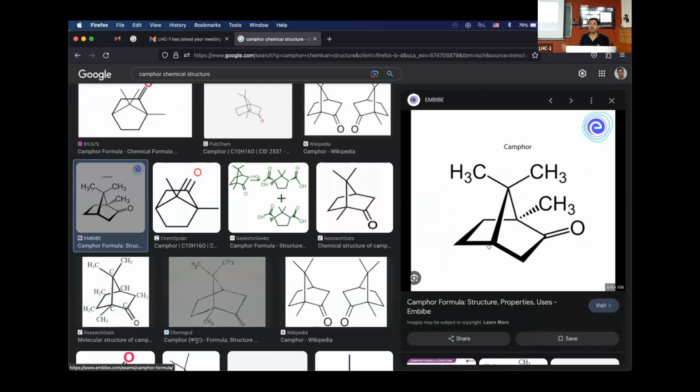And in addition, you are reducing the hyperfine coupling splitting between protons and scalarly coupled protons. And therefore, the NMR spectrum would change. Is that right? So it's a very important marker to understand what changes have happened and whether you synthesized the right molecule. This is predominantly the way chemists end up using it.